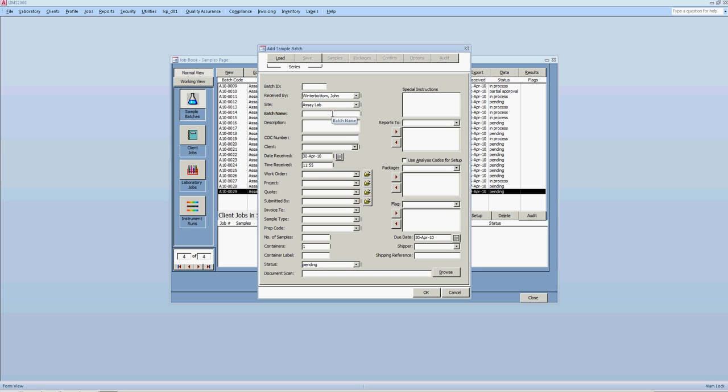So let's say I would want to create a batch. I would put the batch name? Normally in the batch name you enter an internal reference or a client reference. Sometimes they have already like a submission number or order number. So what would be a good example of a batch name in this case? I don't know.